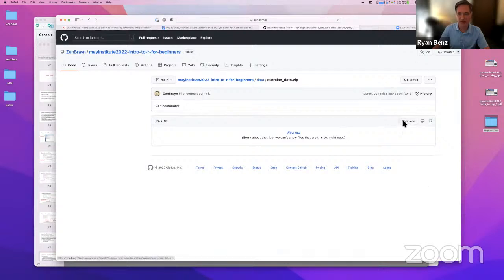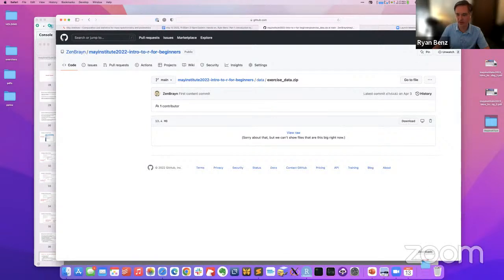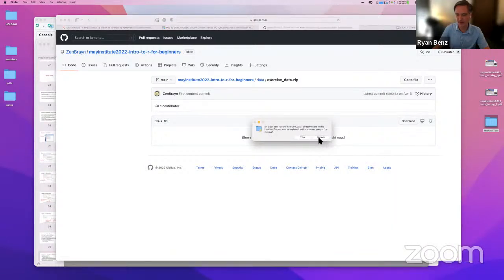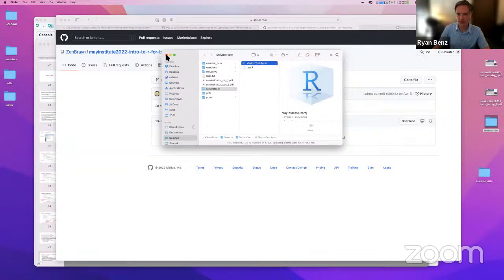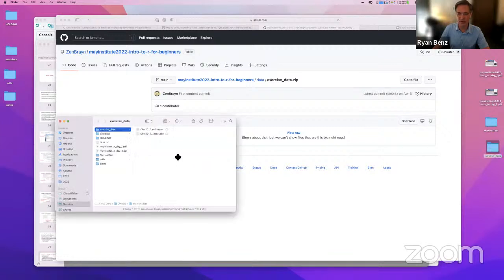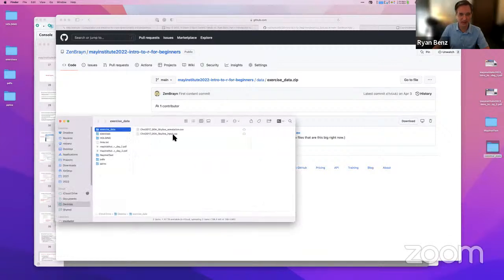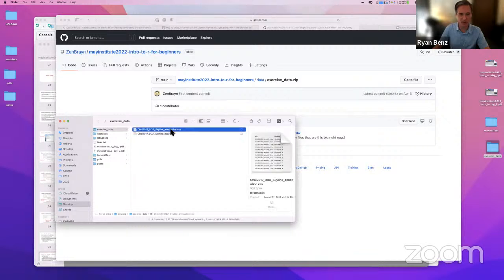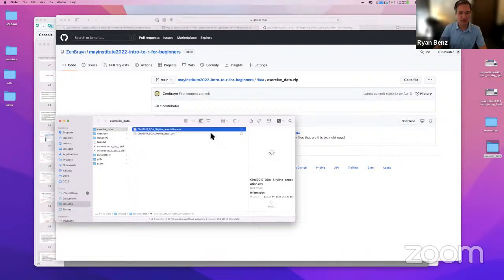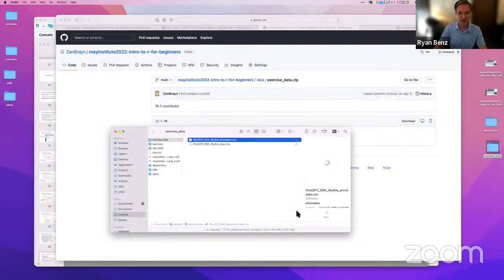Let me redo this here. It's going to download the file, and then I'll just replace it here. So you're going to download this data and unzip the file, and inside this directory you're going to see two files. We're working with the one that has annotation. This file is a lot smaller than the other. The other one is quite big, almost 200 megabytes, so let's not deal with that now. You're going to use this annotations file for this hands-on section.